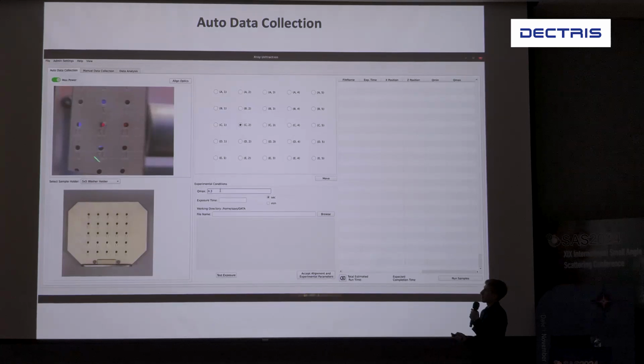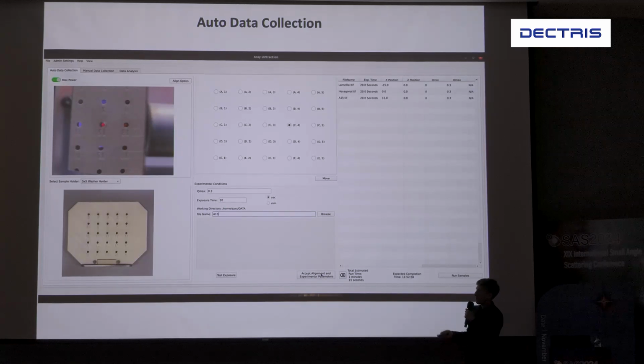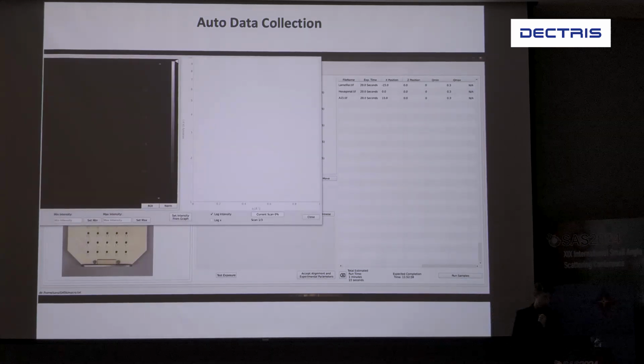seamlessly. So basically, we can 3D print a sample holder to match your sample. You choose it there, you pick where it is on the grid, give it a Qmax, a sample name, and then it goes to this queue. If you want to manually do this, you can with other tabs, and there's also a data analysis tab here, which I coded basic Rg fitting, spherical fitting form factor.